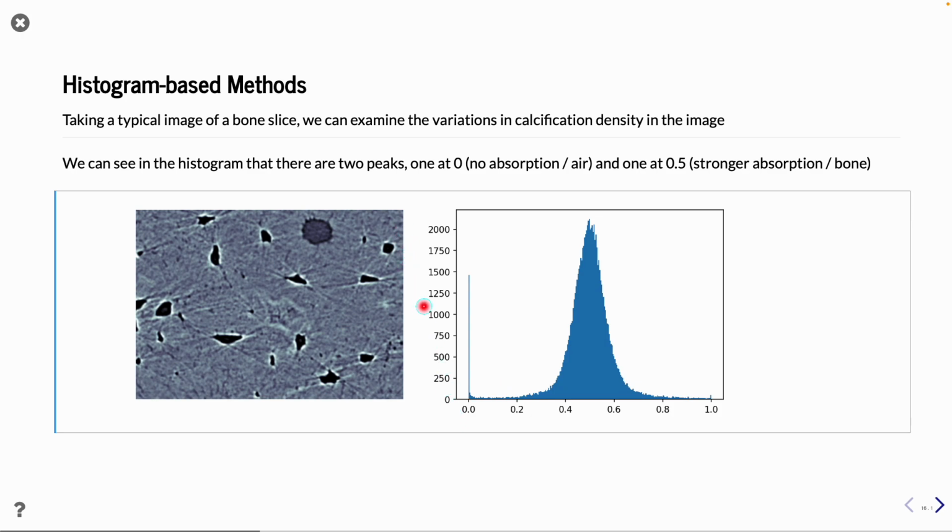The very high peak here is probably some kind of data clamping, so it should actually continue deeper down. But because of the gray levels available in the image, we couldn't get that. Anyway, there is a little bit of a rise back here, so we could guess that the threshold should be somewhere between 0 and 0.2. That would probably give a reasonable starting point.